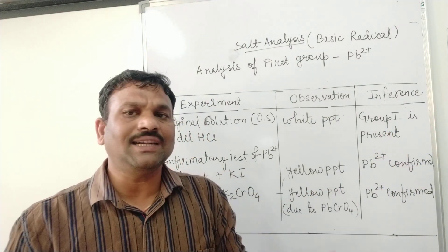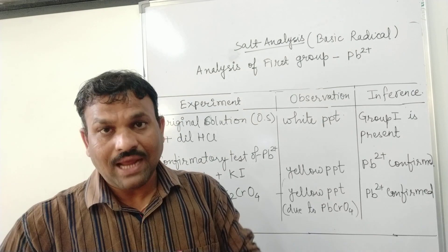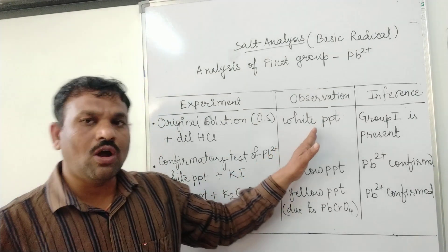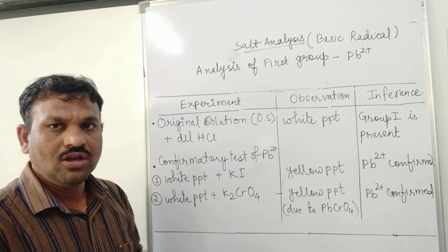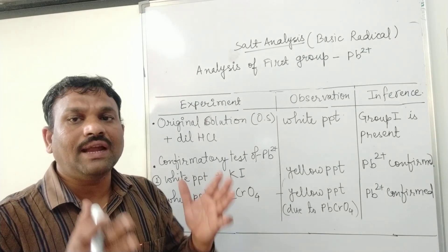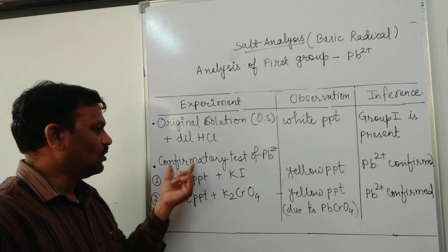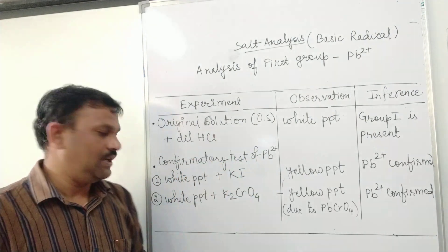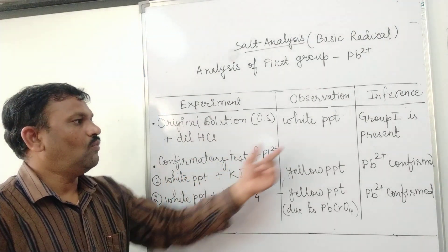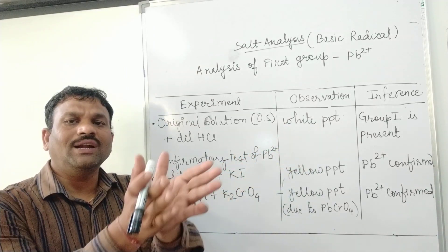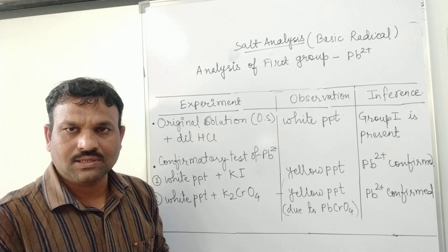The formation of a white precipitate indicates the presence of group 1. If this white precipitate is not formed, we move to the second group. But since the white precipitate is formed, we have to check for the presence of lead. The white precipitate is to be divided into two parts because we need to perform two different confirmative tests.